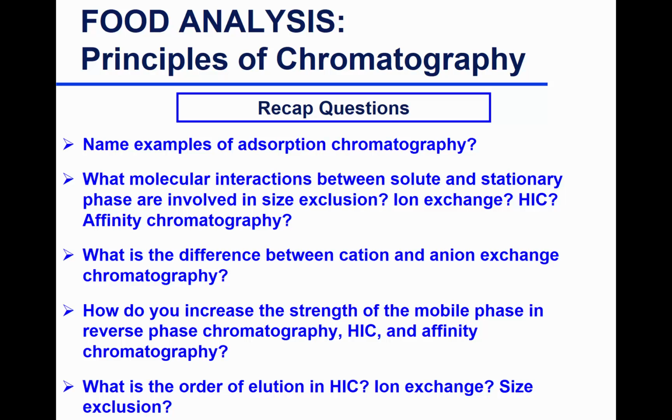So remember that compounds are interacting with the column. And the stronger the interaction, the more they're going to stay on your stationary phase. So what will elute first? Less hydrophobic. So the more polar will elute first. Okay.